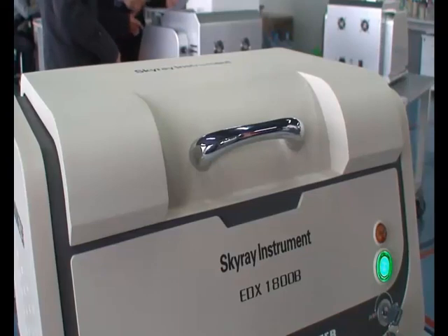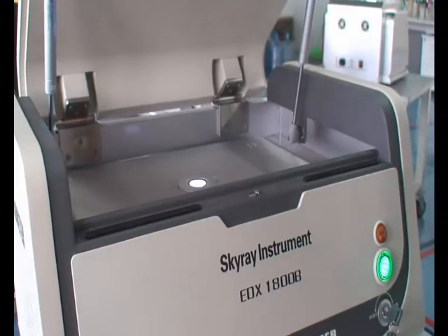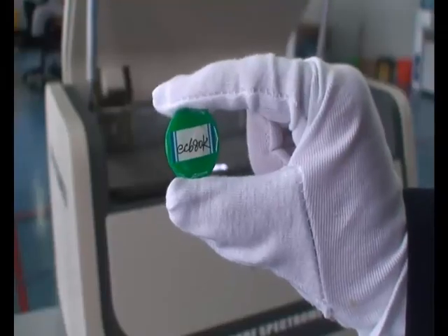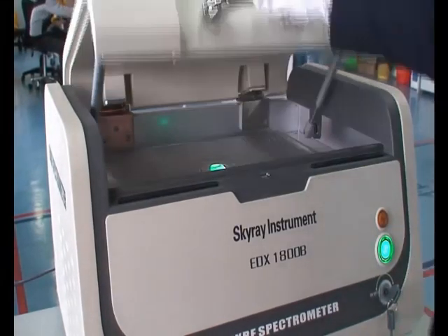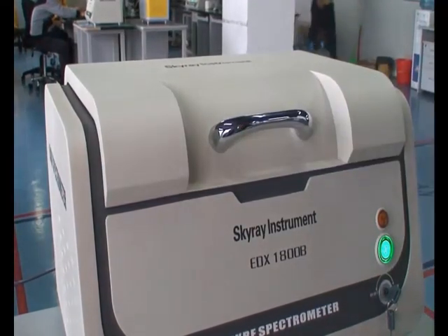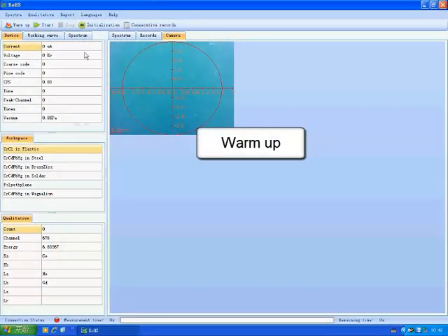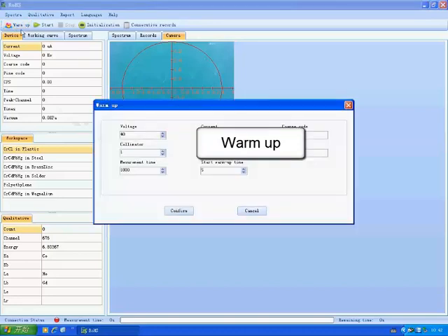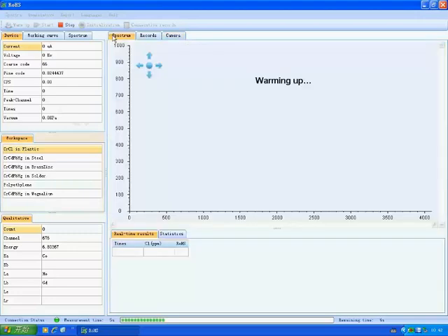After launching the software, put in a waste sample and click Warm Up. We can see a dialog box popping up. Set parameters and click Confirm. The device starts to warm up. When it is warming up, the high pressure indicator light is on, while no spectrogram is shown.